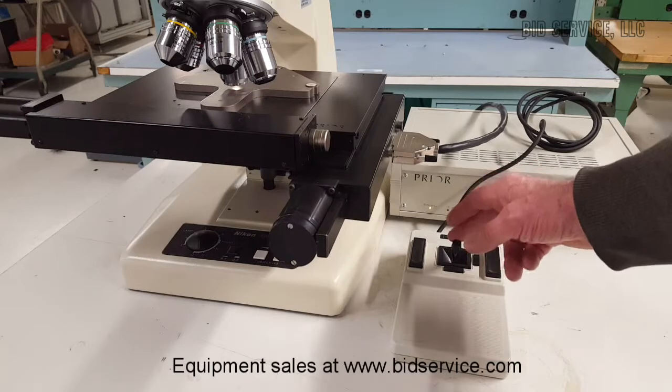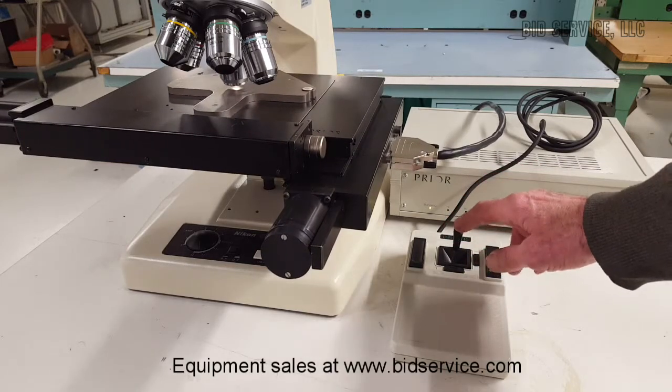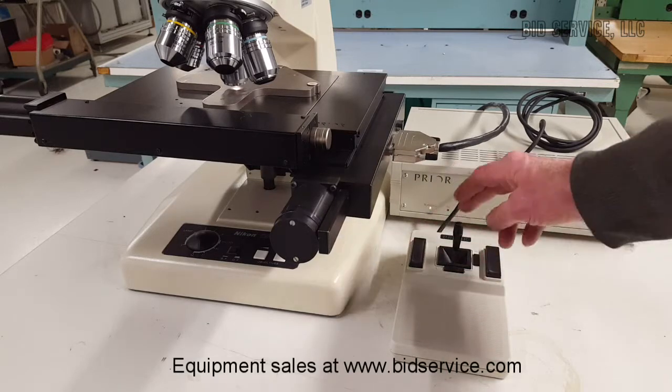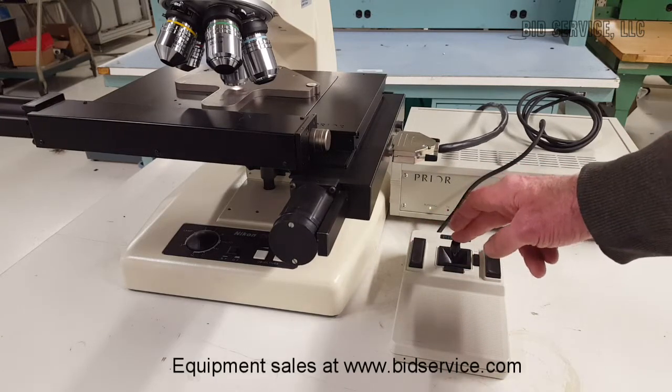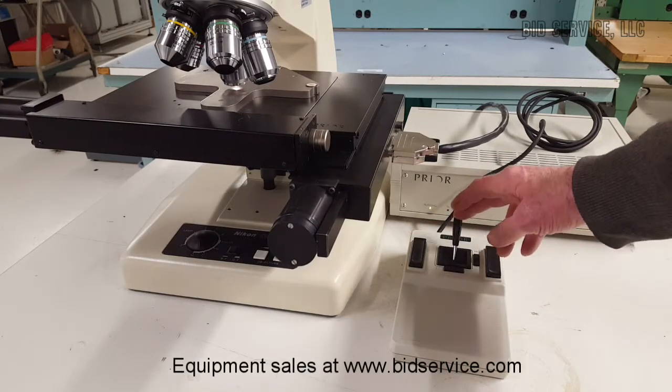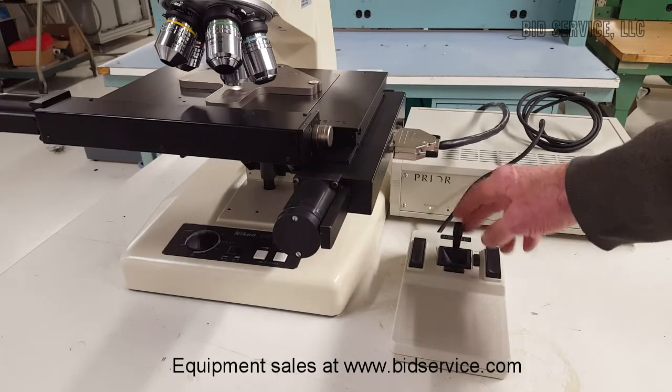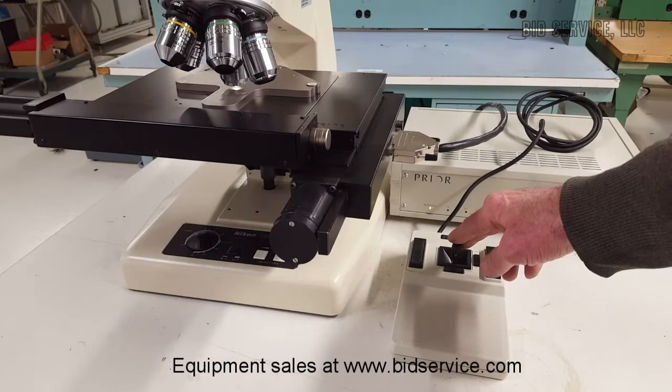Here's your stage joystick. This button here, you can change the speed. And it has three different speeds.